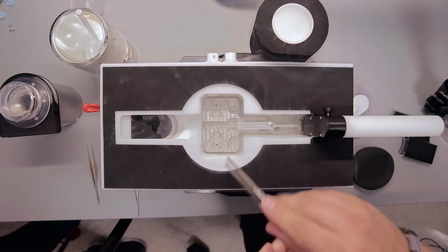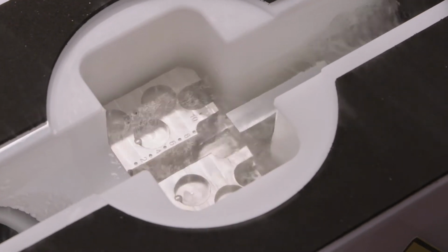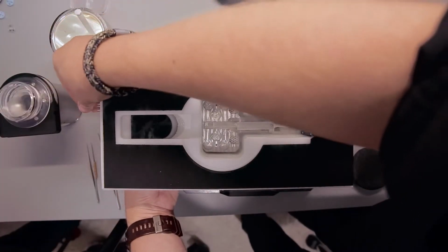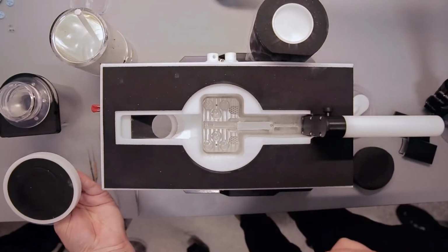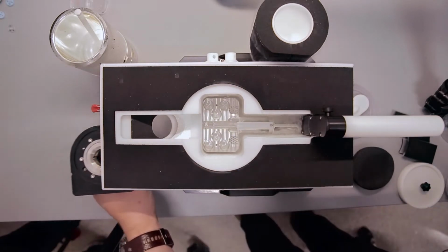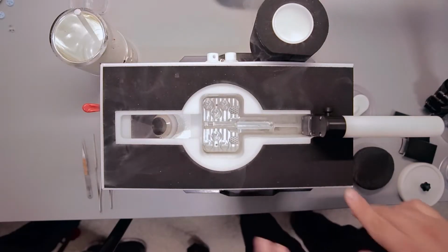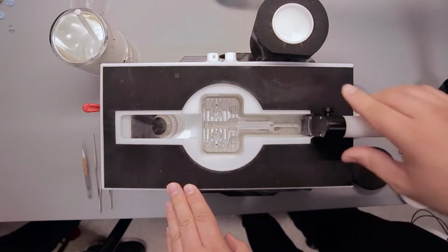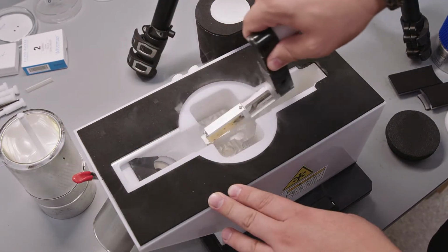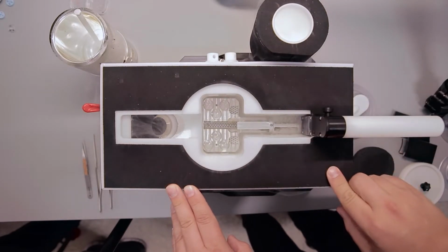We can now see that there is no more heavy boiling around the loading block. So our station is cooled down. We can now remove the plug here and we mount the capsule. We can take the cassette out of the capsule and place it in the loading station.